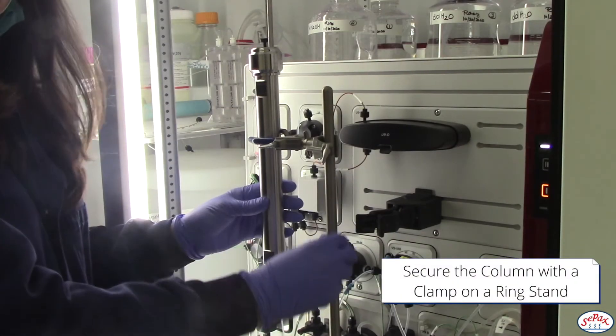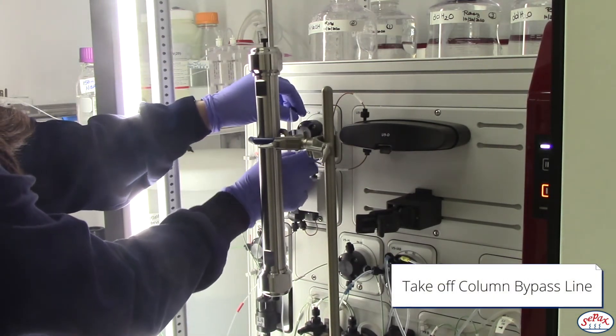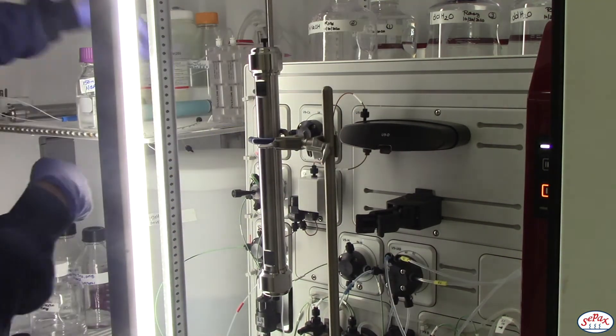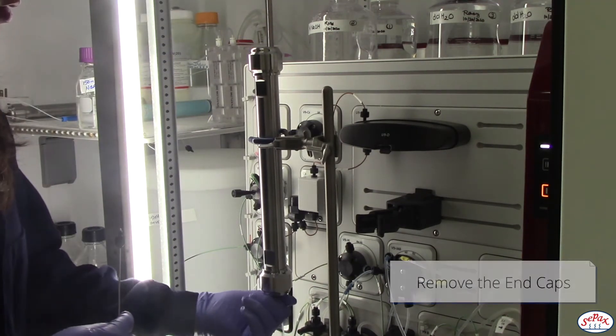Secure the column with the clamp on a ring stand. Take off the column bypass line. Remove the end caps on the column.